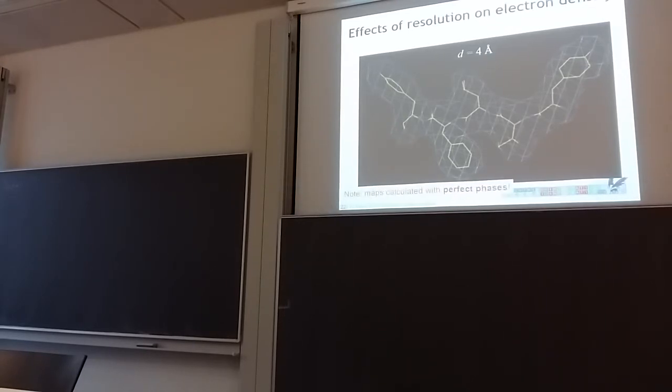These densities that we're showing here are actually very clean because they were constructed. They were not measured. They were calculated based on the bit of molecule that is shown here, and therefore you also know exactly the phases. So real densities are not that good.